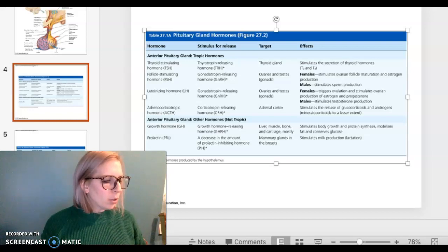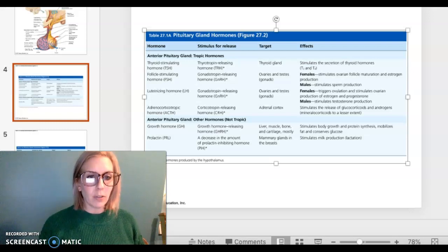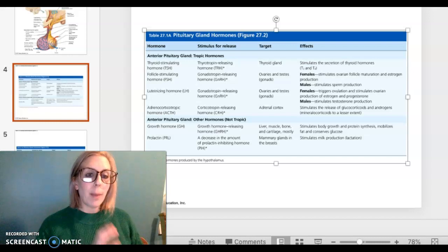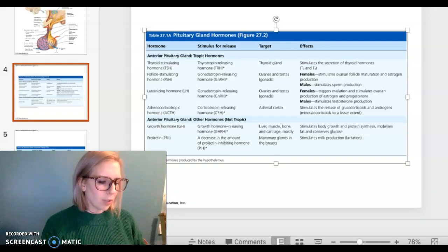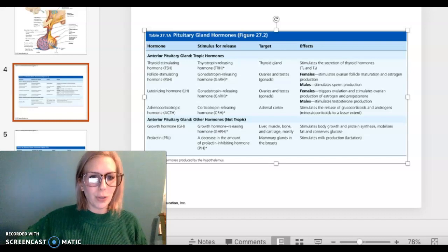And what we're going to do is we're going to look at the microscopic anatomy of some of our endocrine glands. So page 402 starts our activity 2. This is where we're going to examine the microscopic structure of some of these endocrine glands. So we're going to kind of pop back and forth between these charts if you want to bookmark that or sticky note that for yourself, and take a minute to do that, and then come on back to activity 2 on page 402 when you're ready.